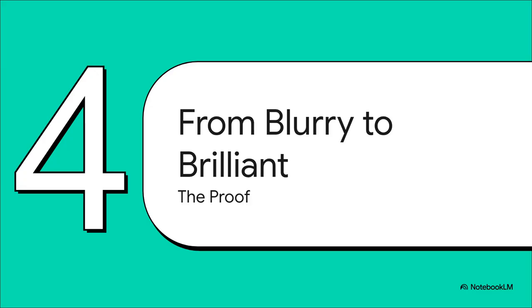Okay, so that's the theory. But does it actually work on real-world images from a lab? Oh yeah, the answer is a resounding yes. The results are just fantastic.